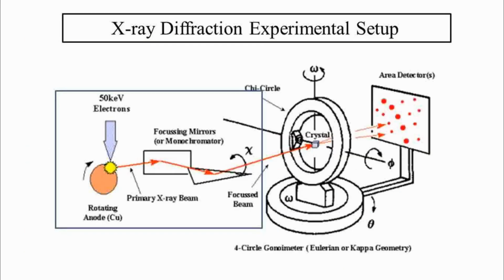Now coming to the actual system schematic diagram. This is the schematic diagram of the X-ray crystallography system, where your X-ray is generated. You basically have two focusing mirrors, one in the X and one in the Y. Why X and Y? Because you have to scan your entire crystal, it is not a dot, right? So these X and Y mirrors keep focusing and changing, so it scans the crystal which you are positioning inside.